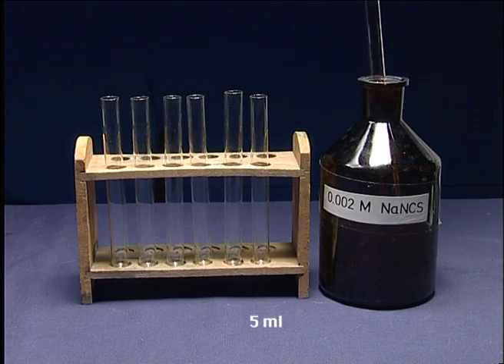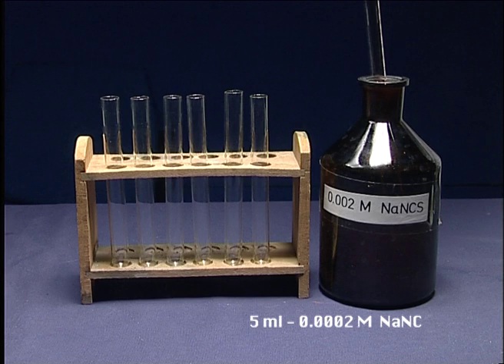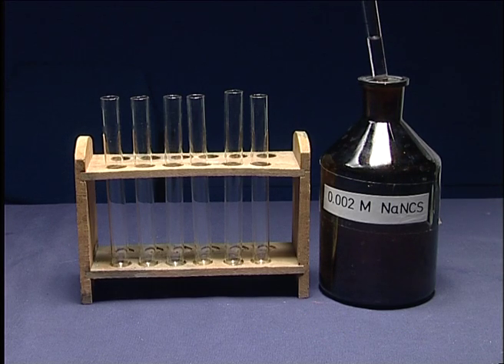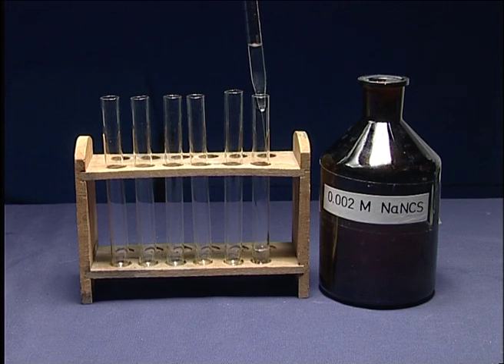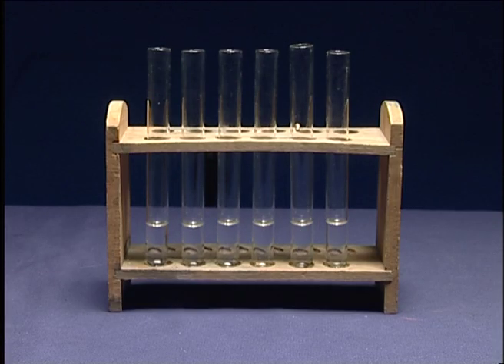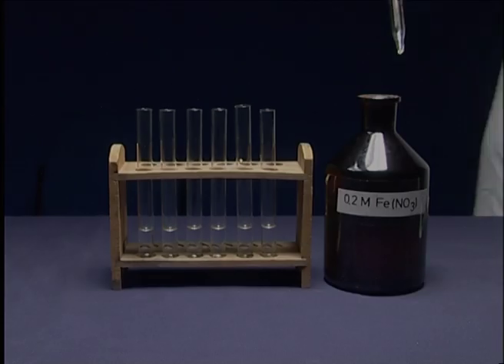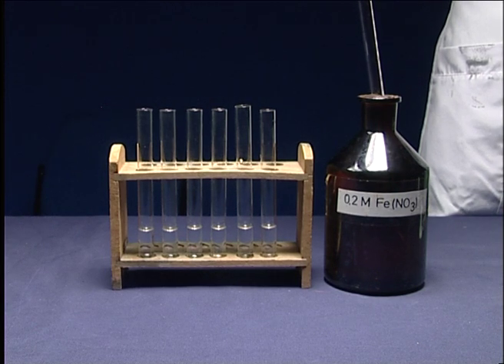Put 5 ml of 0.2M Sodium Thiocyanate into each test tube. Add 5 ml of 0.2M Ferric Nitrate into the first tube.